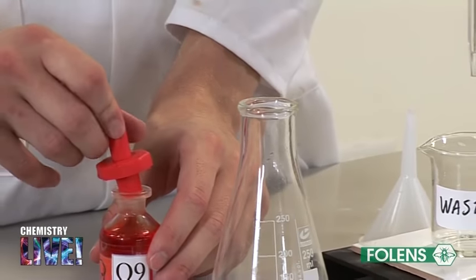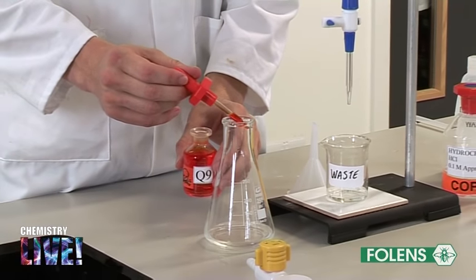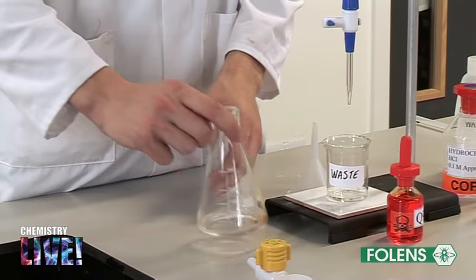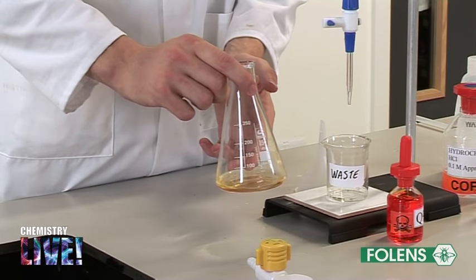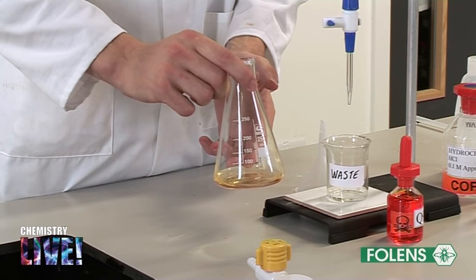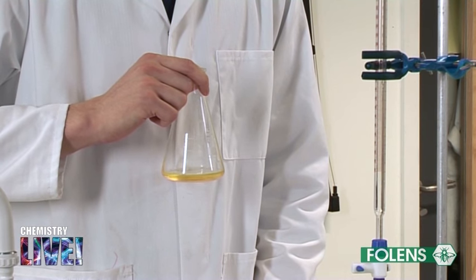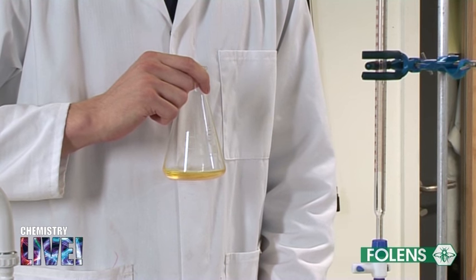In the fourth part of the experiment, add about 3 drops of methyl orange indicator to the sodium carbonate in this conical flask. Note the yellow colour. Methyl orange is yellow in neutral or basic solution and red in acidic solution. Do not use too much indicator, as an intense colour may make it difficult to see the colour change at the end point. In addition, as we will see later, indicators themselves are either weak acids or weak bases. Adding too much indicator could affect the result.